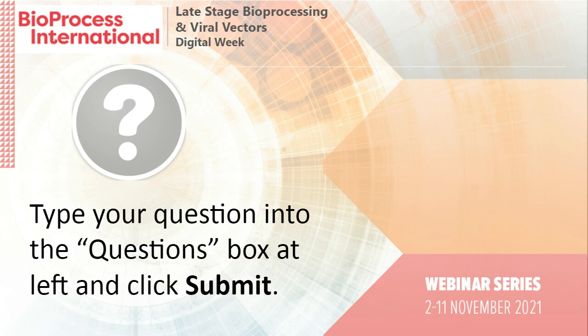When it comes finally to the possibility of host cell DNA being packed in your partially full AAVs, this is already a lot more challenging thing to test. Basically, if you don't know what target you're searching for, you are not able to use PCR for it. In these cases, it will probably be best to collect this fraction and then perform sequencing. I think this is probably the only way you can find out what is packaged in your partially full AAVs.